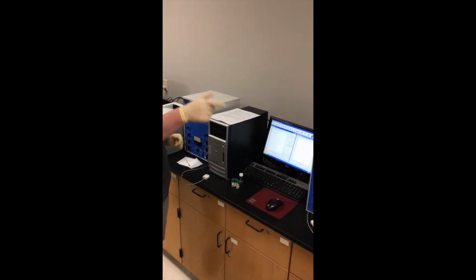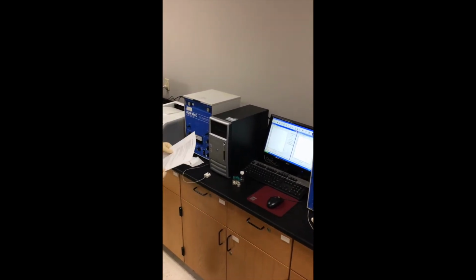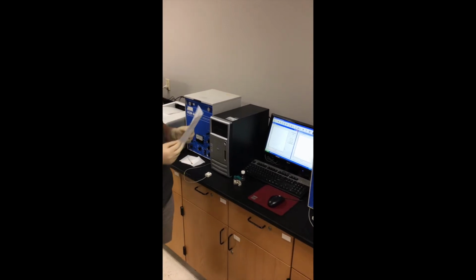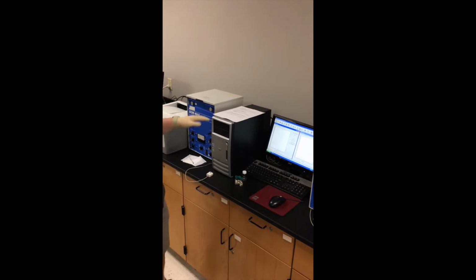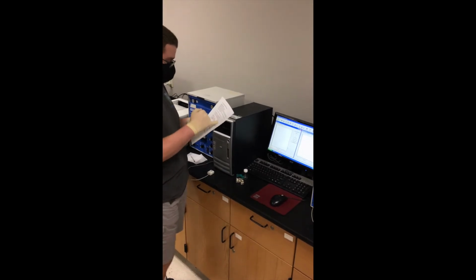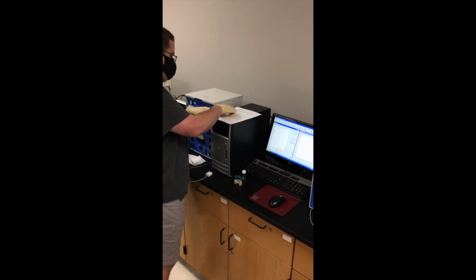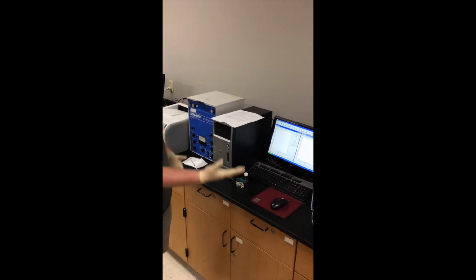In here, we already have laid out papers. We have 2 individual instruction sheets. They have GC instructions on the front, and instructions for the experiment on the back. Pretty simple, pretty straightforward, but I'm going to go over them. The good thing is that because all of it is previously done, about half of the information is satisfied before you even get to lab. You will start right after it says you are enlarging a channel to full screen. This is what is already set up for you.